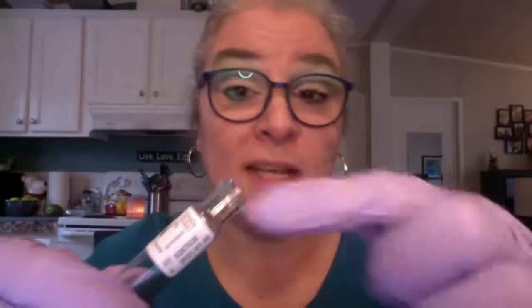You start down at the bottom and you smear your way out of the tube. Remember, you don't want to touch the mouth of a test tube like this any more than you absolutely have to, because you might introduce a contaminant. And as soon as your tube is inoculated, into the incubator.